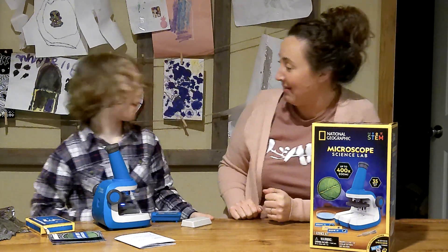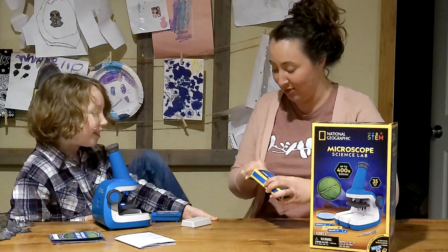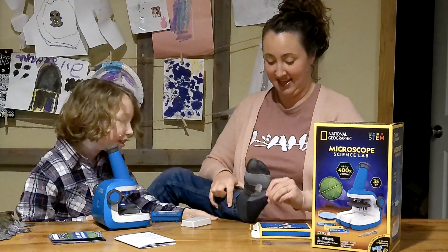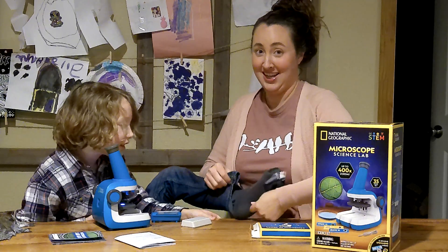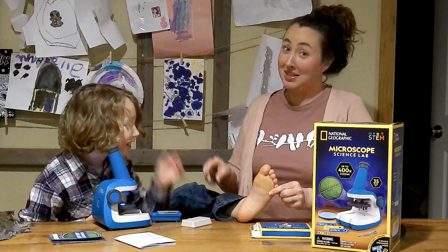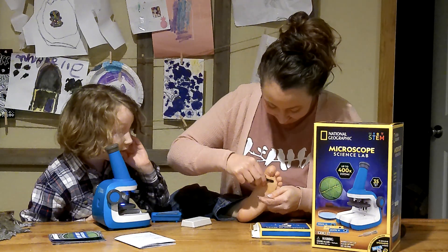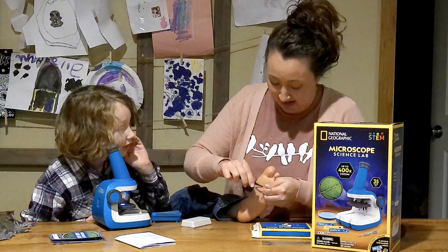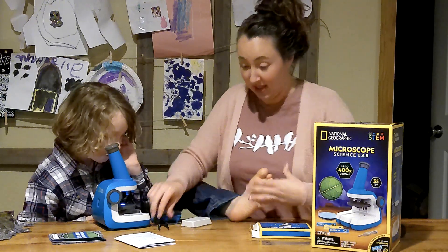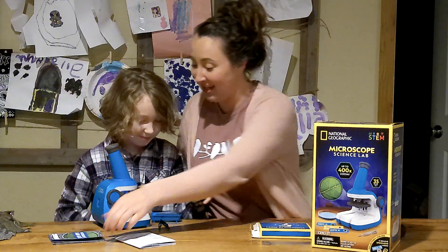Slide your foot up here and let's take a sample. Let's do it. Take this off. Get a smell test. Oh my, definitely some bacteria on there. Mommy! Okay, we'll do that for later. Let's continue on showing our viewers the other parts.